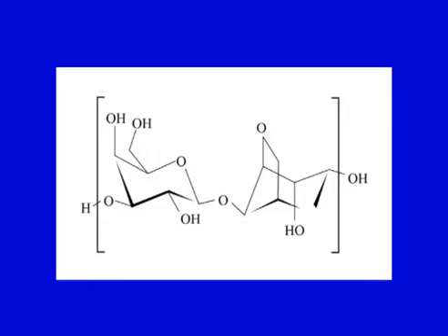Now, this is a simple schematic of the two units which agarose is made of, that is the repeating unit, agarobiose. Now, the gelling properties of the agarose are attributed to both intra and intermolecular hydrogen bonding within and between the long agarose chains. So, the whole matrix which is formed is due to the hydrogen bonding pattern.